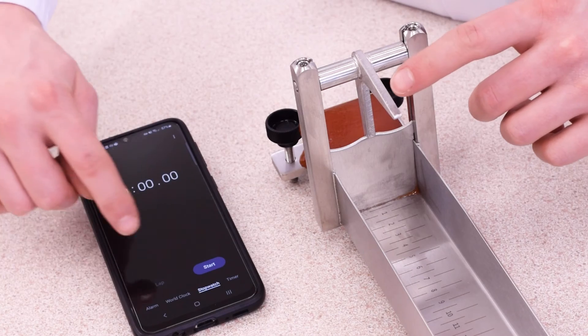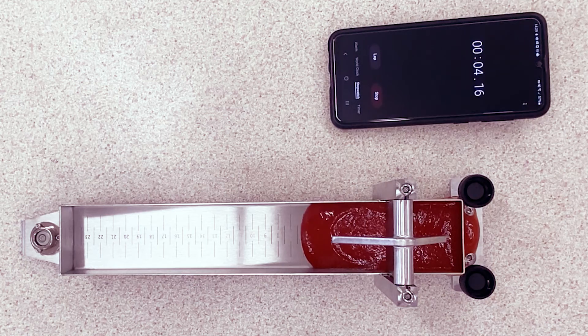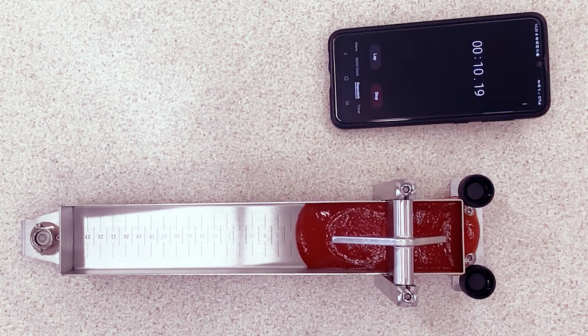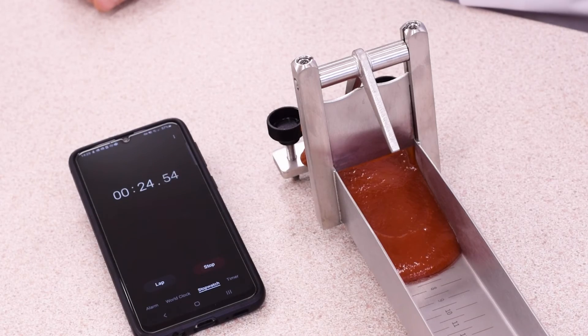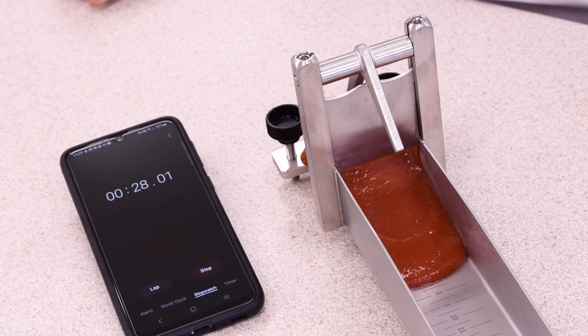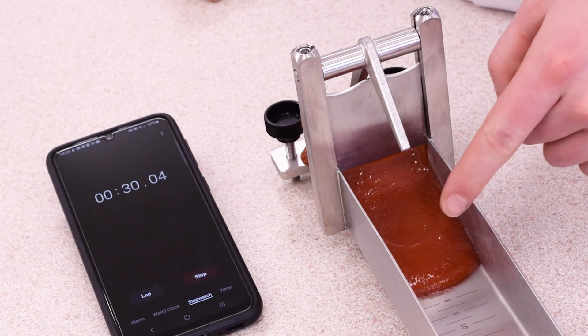Simultaneously start the stopwatch and release the gate. Then measure the distance the sample has travelled over the pre-established time period. It's important to keep this consistent when comparing results and then to take both the edge and centre measurements.